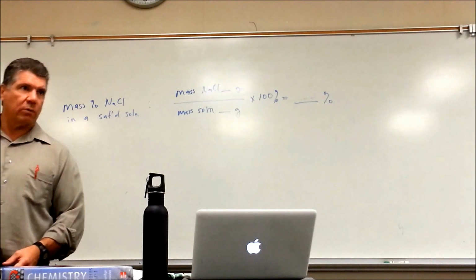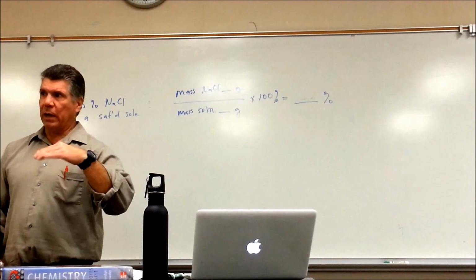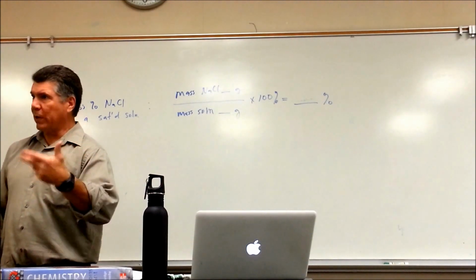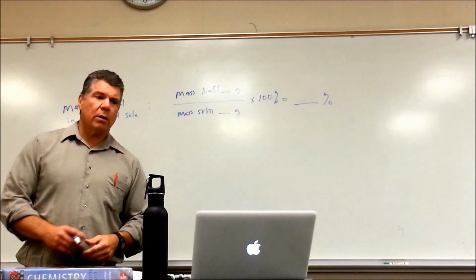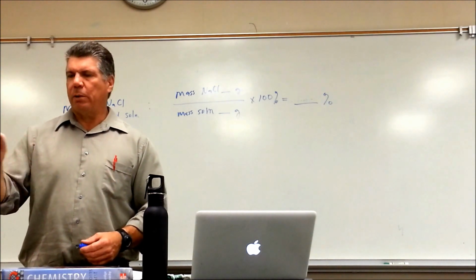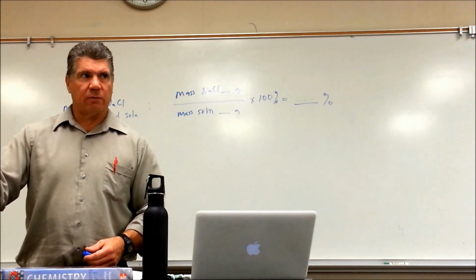The mass of the sodium chloride is after your last flaming. Do you guys know what I mean? Remember, after you evaporate most of the water with the water bath, you put it on the flame with the wire gauze, and you flame it at least 2 times, 3 minutes each. After the last flaming, once the mass is within 0.01 grams of the mass of the previous flaming, then stop, and take the mass of the last flaming.